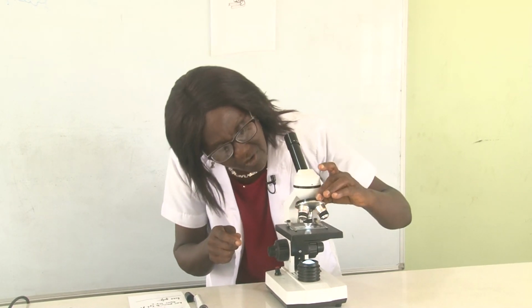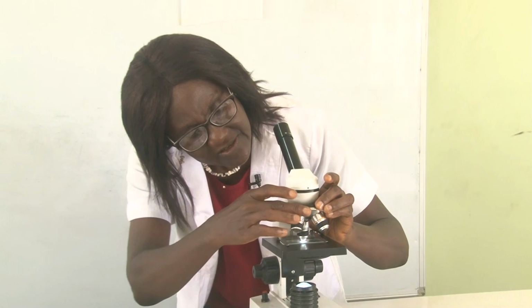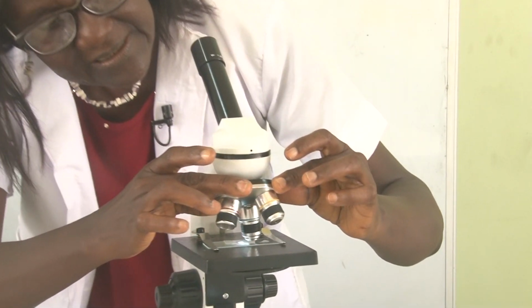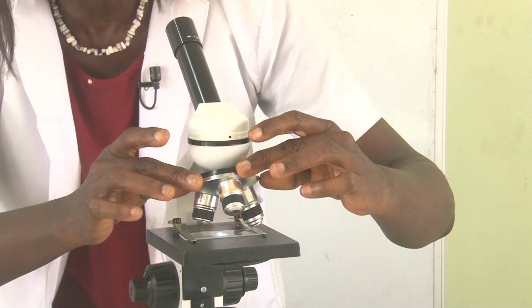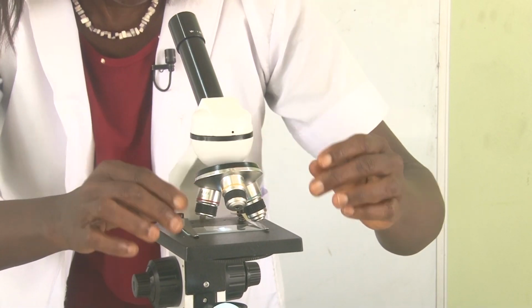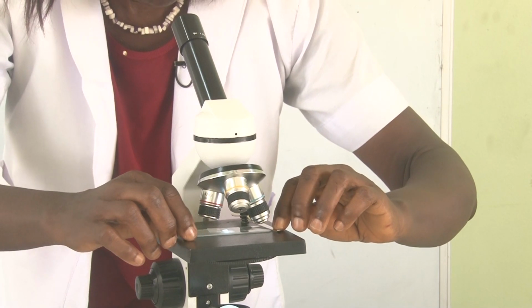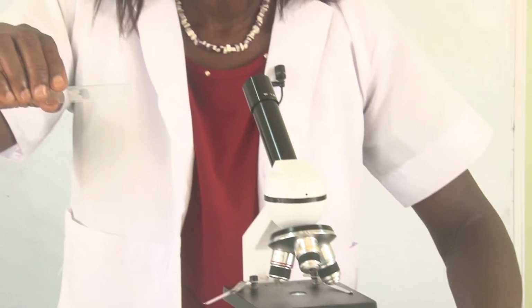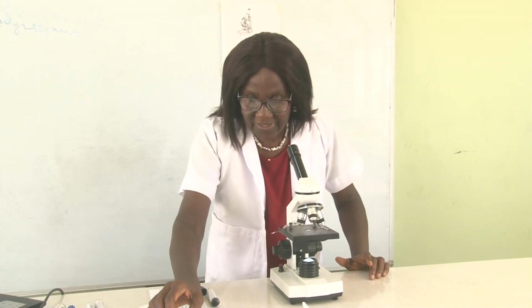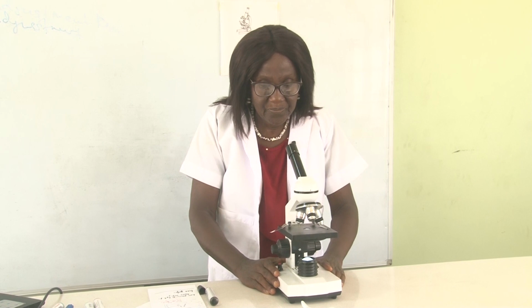So you turn the revolving nose piece away from the center of the stage. Then you can take the clips off and take your slide off. So that is high power. So this is a quick run through how to use the optical microscope.